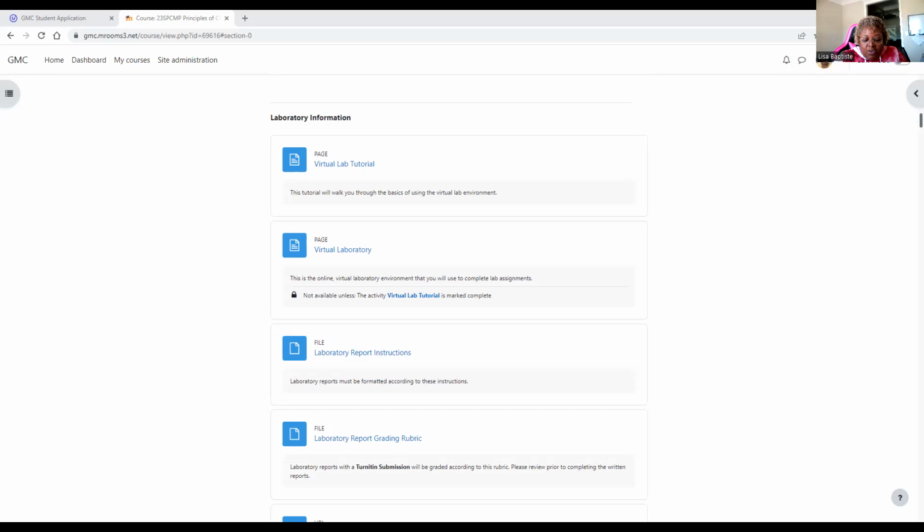All right. When you're taking measurements for the lab, always have a notebook or a piece of paper or something handy so that you can write down all your volumes as well as mass measurements. Those you're going to include in a table when you type up your lab report.